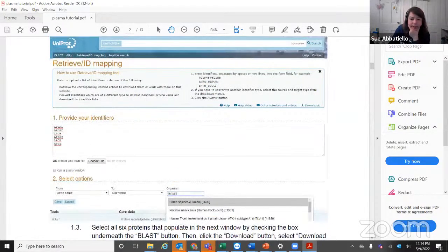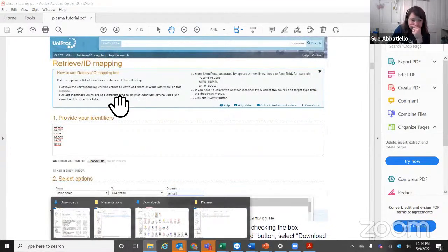This is how you would get the FASTA files for your proteins and load the sequences into Skyline, because Skyline needs that information in order to generate peptides from the protein sequences, or you give it a list of already clipped peptides from the digestion process.